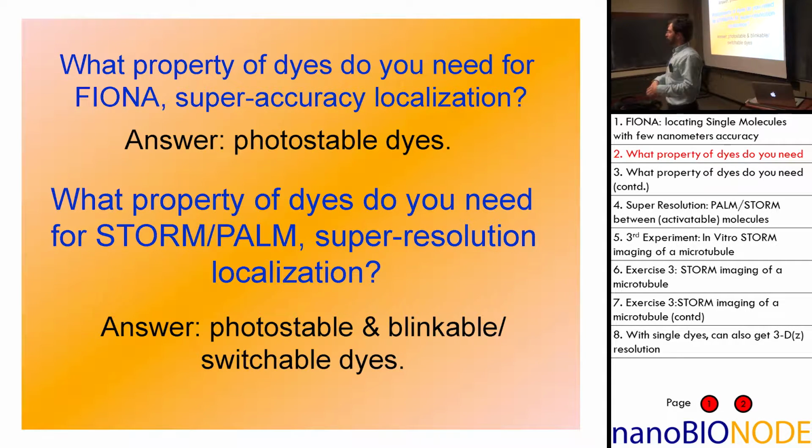It may have to do with the triplet state, although it frequently doesn't. You treat it sort of like magic, in the sense of a GFP that is not in a state that will fluoresce. And then you can make it fluoresce by shining 400 nanometer light.